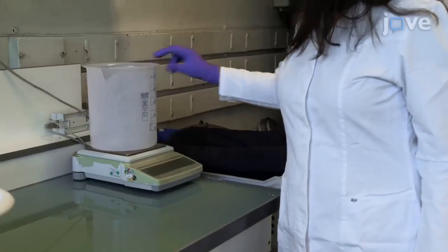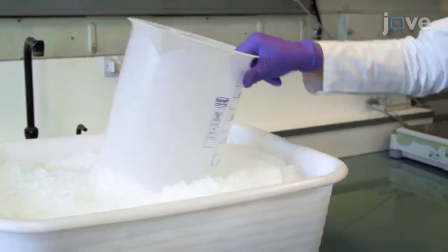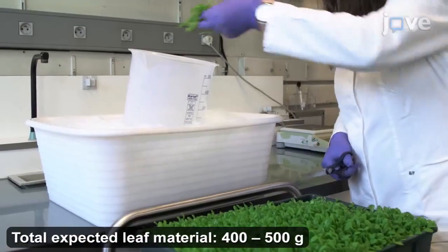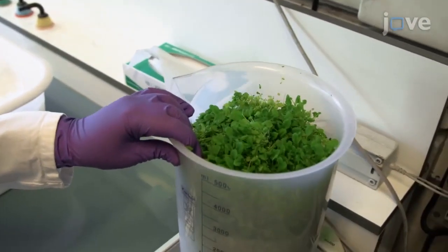The next day, pre-weigh a 5-liter beaker and then place it on ice. Harvest the Arabidopsis leaves, making sure to avoid picking any soil. Re-weigh the beaker and record the tissue weight.